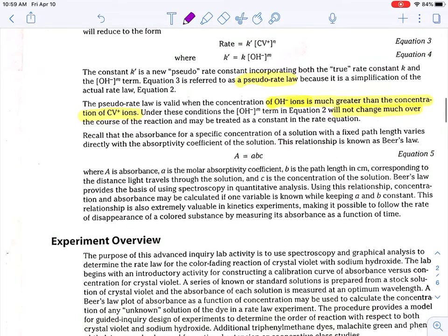Now, here's the next thing. This equation is what's known as Beer's law. Now, don't flip out. This has nothing to do with beer. Don't get all excited. It is kind of ironic that we have the coronavirus and this is why we're doing this on film, but this has nothing to do with beer or anything like that.